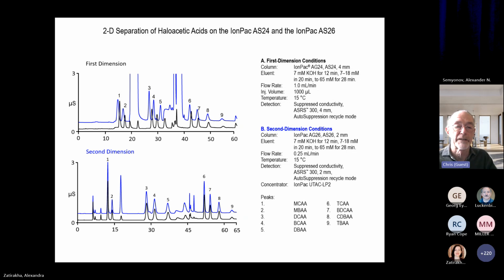It's really hard to separate them all on an ion exchange material. I know Yan can attest to the difficulty of doing this. I think we've been working on trying to do this separation for 30 years until we finally got something that worked pretty well. But you'll see later we've made an even further improvement in this. But both of these are based on hyperbranched materials. Next slide, please.